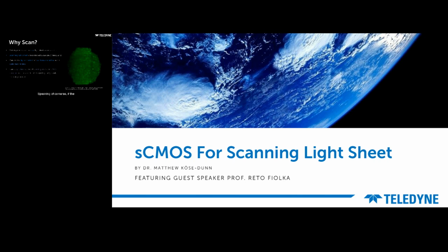Speaking of cameras, if the scanning of the light sheet can be synchronized with the rolling shutter of the CMOS camera, it can act as a sort of confocal slit, rejecting background and improving contrast. And this kind of reduces the dark time and further improves imaging efficiency. Teledyne Photometrics CMOS cameras do have full advanced control over their rolling shutters, and this is known as programmable scan mode. We'll discuss that further into the webinar.